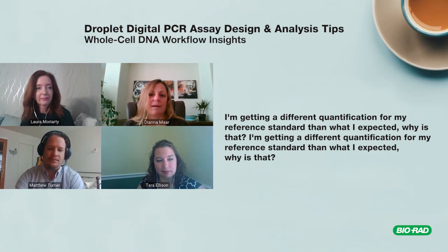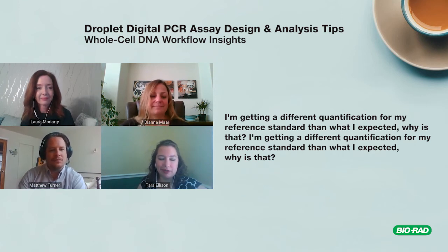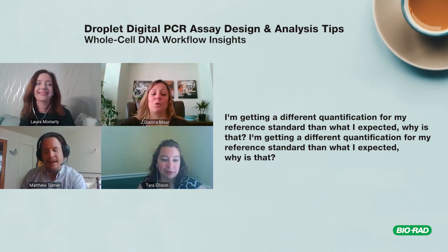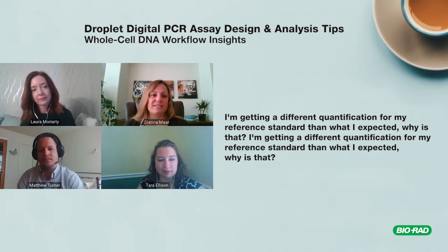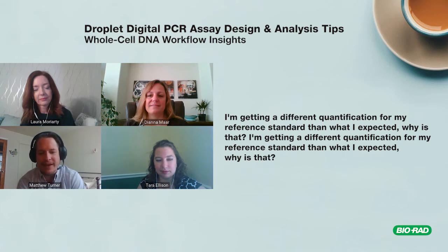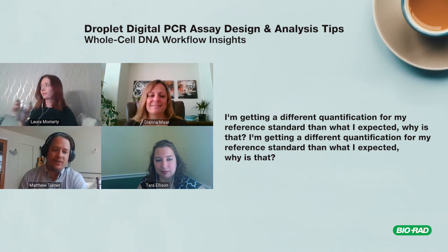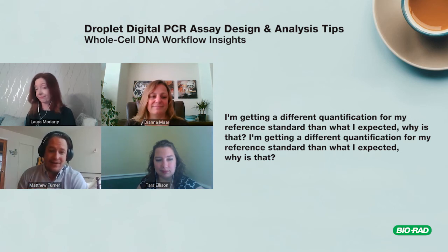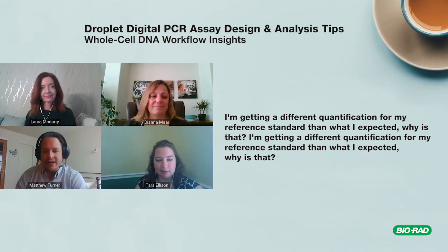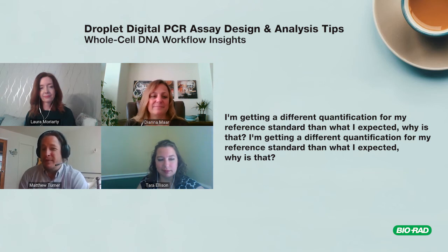Also consider how long your standard or control has been sitting around — degradation and freeze-thaw cycles are factors. Plasmids tend to supercoil without restriction enzyme digestion, which can impact PCR. Matt recommends aliquoting out what you're going to use for a particular run so you're not going through freeze-thaw cycles. DNA, RNA, and proteins do not like freeze-thaw. Try to aliquot things out and anticipate your usage so you don't lose half a vial of supermix that would have been perfectly fine.